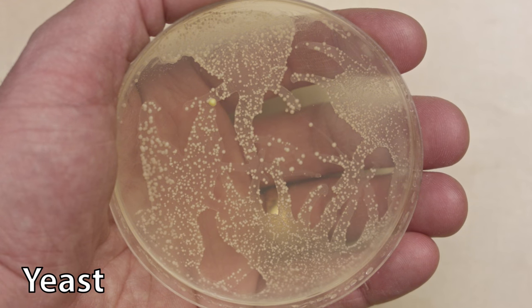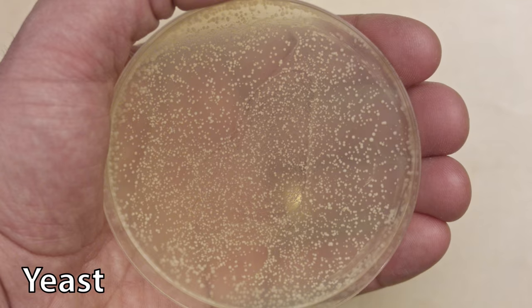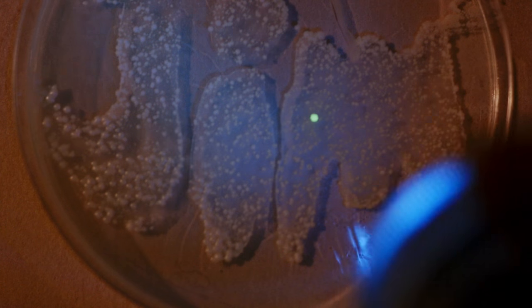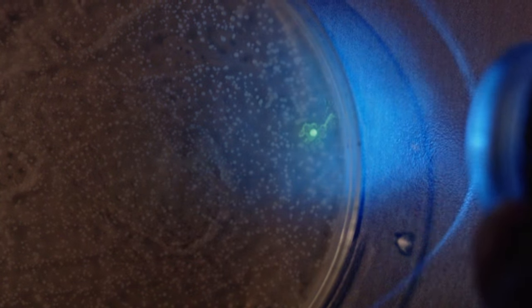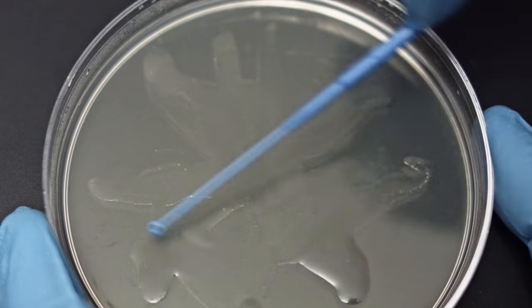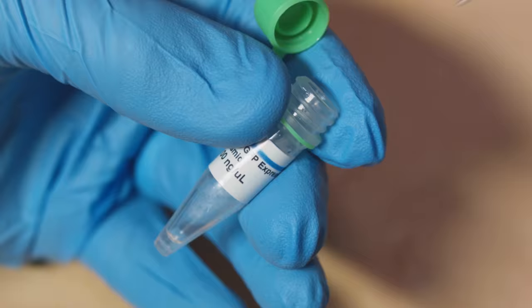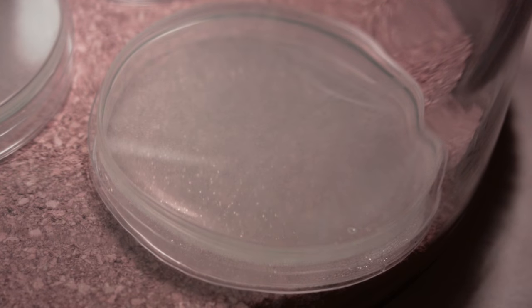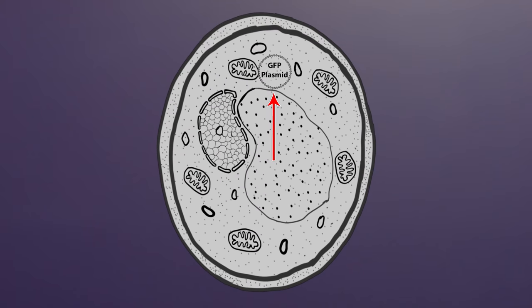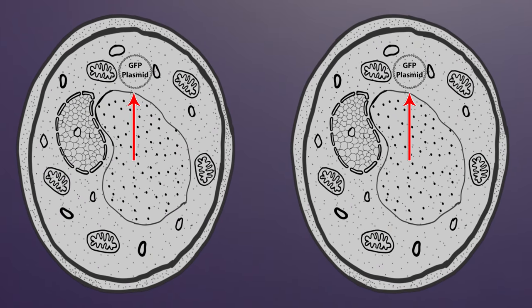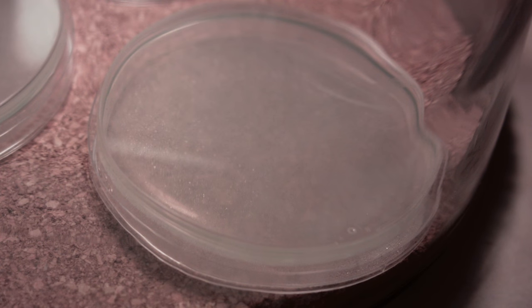The yeast experiment had some odd results. I had yeast growing on all the plates, but I only seemed to have 1 fluorescent yeast colony on each, especially compared to the example plate provided by the Odin. I noticed this while the yeast was incubating for the final time, so I ran the experiment again using up all the materials, but with the same results. Those plates were from both. I figured that the only yeast that should have survived are the ones that replicated the plasmid with the antibiotic resistance. I decided to keep incubating the plates, and it took a couple of weeks to get some better results. There was still just the one dominant colony, but it appeared the others were at least somewhat fluorescent under the light.